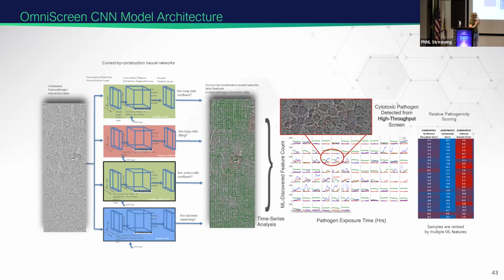And then from that, we're able to get actual scores. As Sam was saying in his talk, we need to let the model know if it's doing a good job. We need a quantitative metric. Because we have this labeled data of friends and foes that we're introducing into our human cell lines, the model can be like, oh, these patterns are patterns of healthy cells, these patterns of the images are patterns of infected cells.